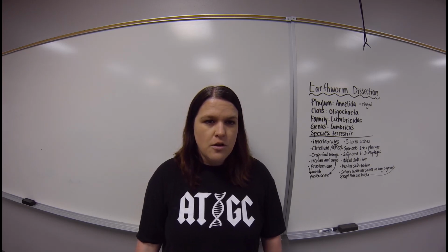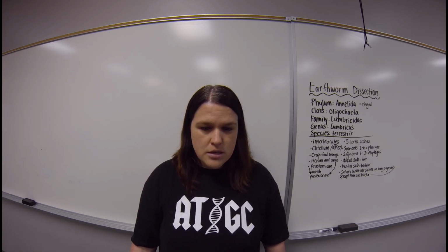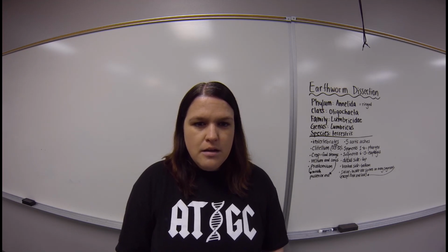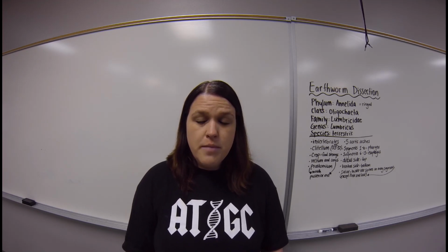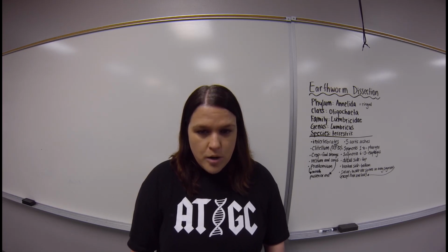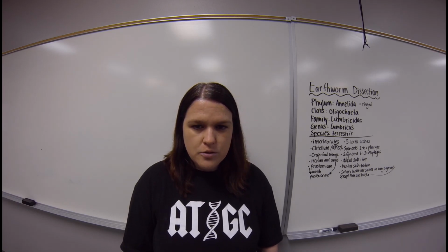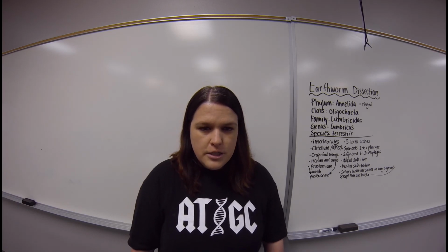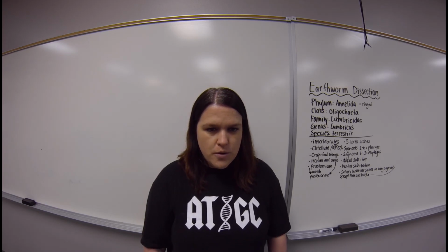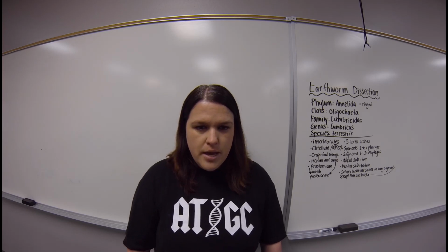Eggs are produced in the ovaries and pass out of the body through female genital pores. Sperm are produced in the testes and pass out through tiny male genital pores. During mating, sperm from one worm travel along the sperm grooves to the seminal receptacles of another worm. Fertilization of the eggs takes place outside the body as the cocoon moves forward over the body, picking up the eggs of one worm and the sperm of its mate.